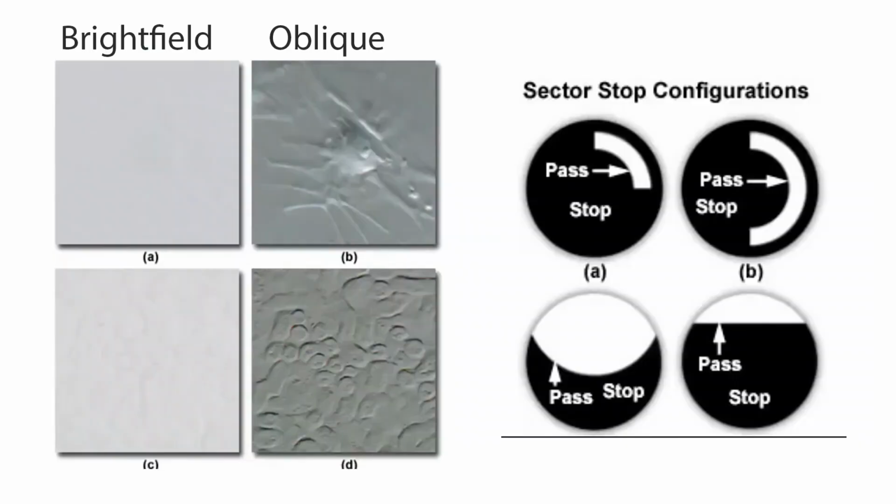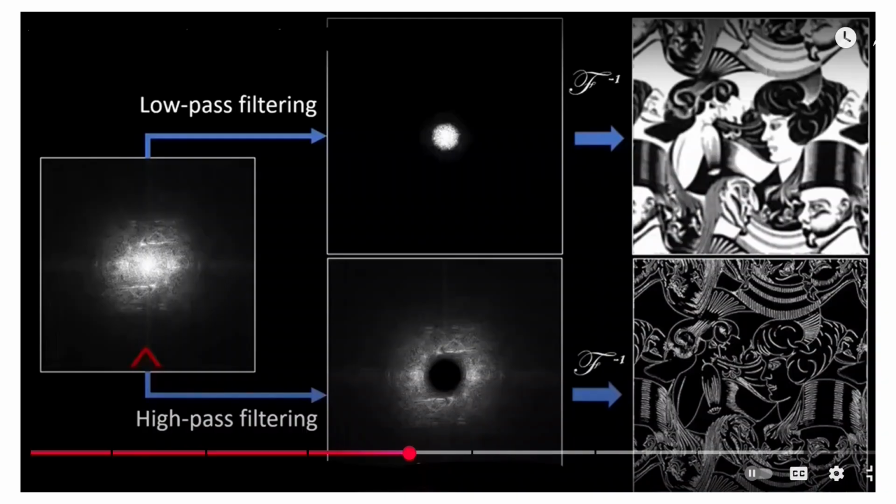In some methods, transparent specimens can be imaged because the diffraction pattern contains information about how much light is slowed as it passes through parts of the object, due to the fact that the refractive index of the object differs from its surroundings. Where phase varies across the object, the gradient or slope of optical path difference can be increasing or decreasing or constant, usually with the appearance of an undulating landscape.